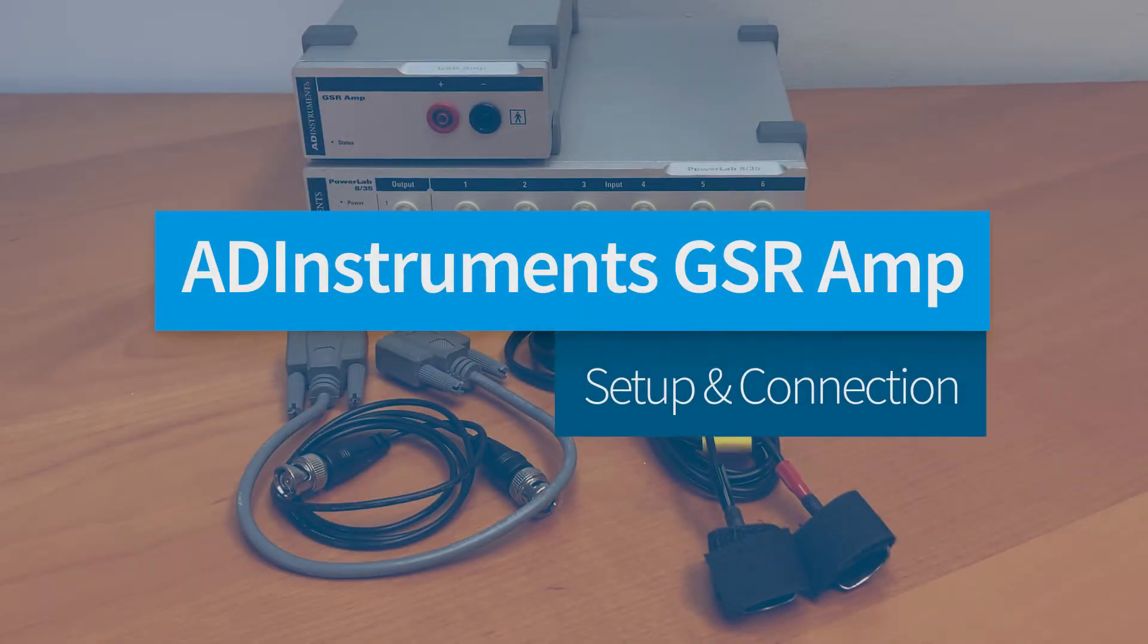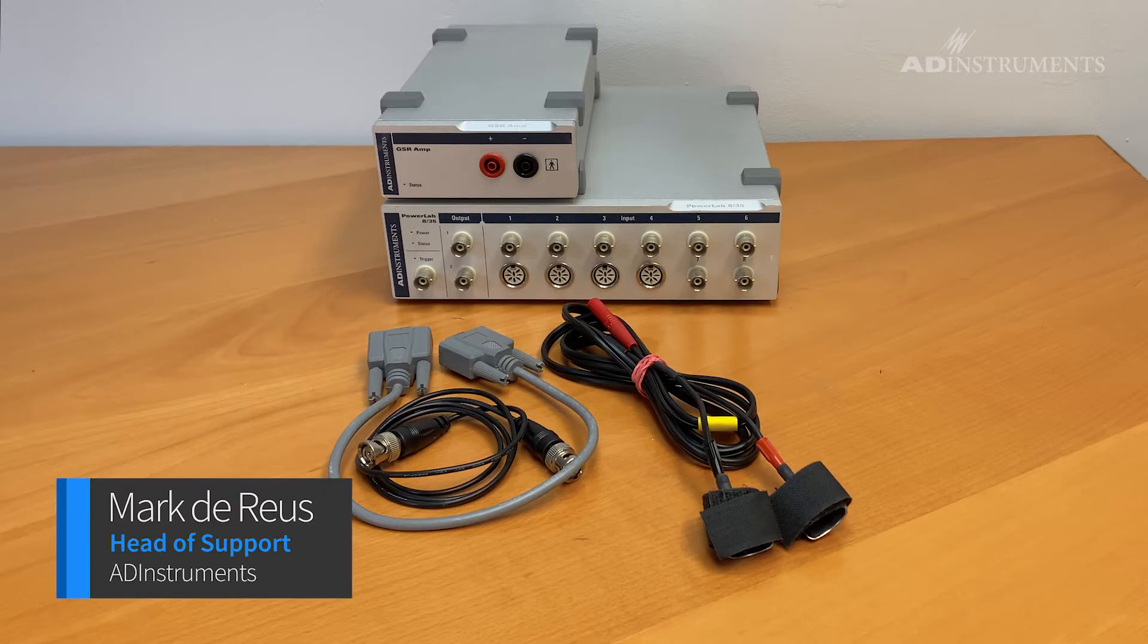This video will demonstrate how to connect and set up a GSR amp and PowerLab for recording galvanic skin response or GSR signals.